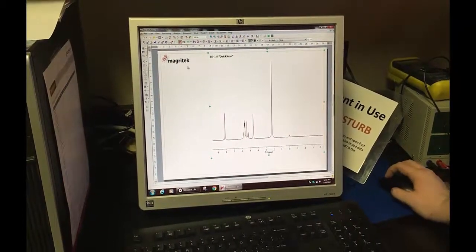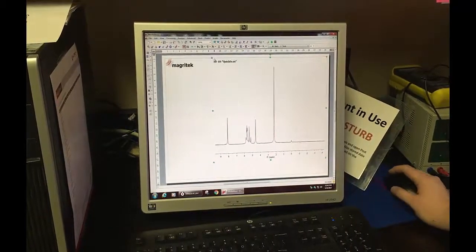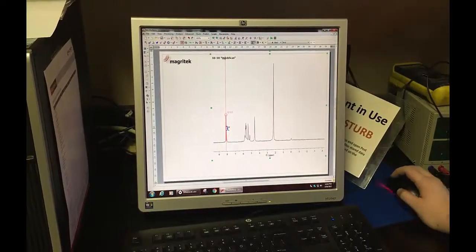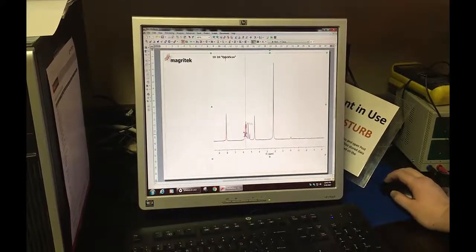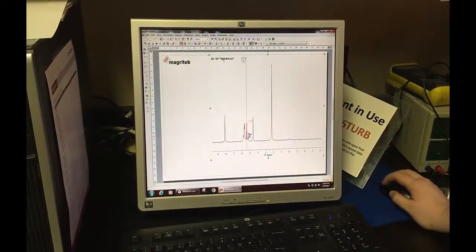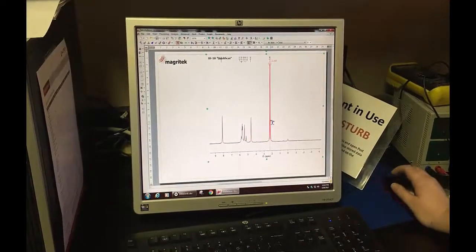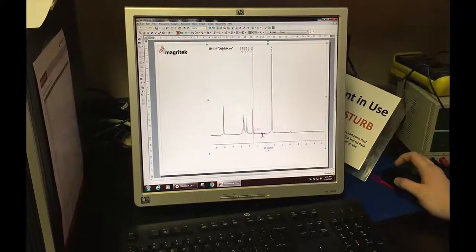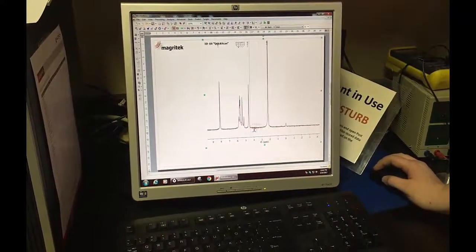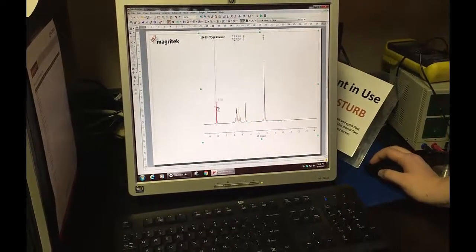So now that I've done that, I'll go back to Analysis and go down to Peak Picking. I'll go peak by peak, and I'm going to choose each peak that I want to reference. So I'll click on those, and those will give me an accurate number of where those peaks come out on the spectra. So I'll just choose each peak that has importance, especially these big ones right here. There's a lot of little stuff right here, and you can scroll up to make these bigger. All these little bitty peaks down here, that's just noise from the machine. Those don't matter. We just want to look at these main peaks right here.